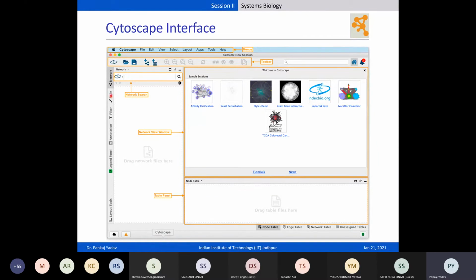And then you have this Style tab. Below the network, you can also go to Style, and you can change the labels, the color of the nodes. You can change the shapes of the nodes.